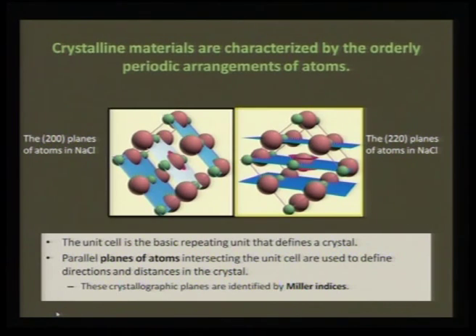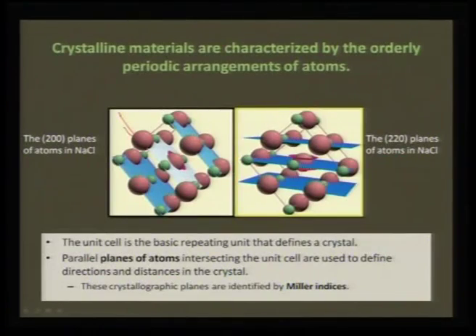Therefore, when the sample is actually rotating, you can see that several planes will come into diffraction. So, this is one plane and this is one plane. Especially these two planes are characterized as 200 planes. This will have exactly half the interplanar spacing as that of your 110. So, if you have 100 plane, exactly half of that will be your 200 plane.